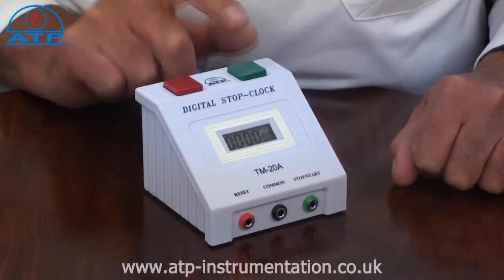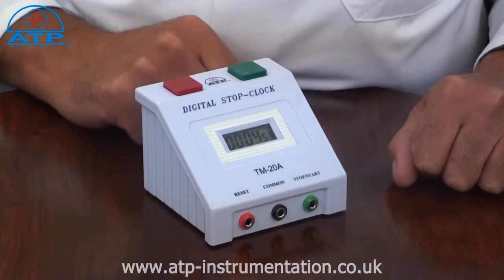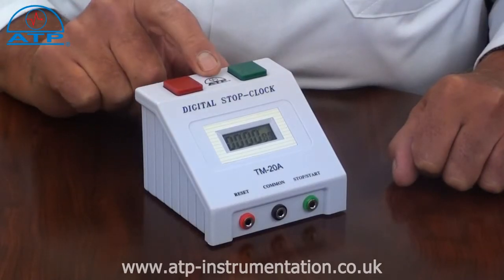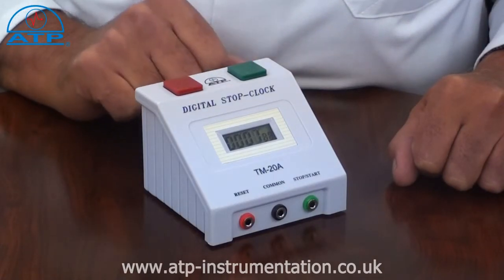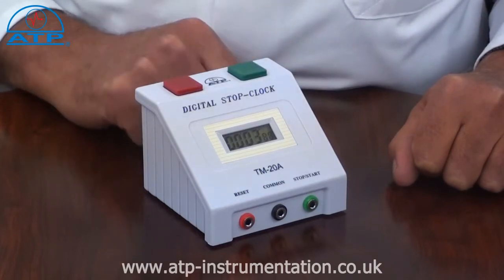To start the stop clock press the green button. The stop clock will count up until stopped. It can then be reset to zero or stopped and started again to add further time.